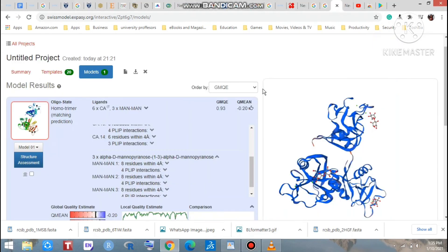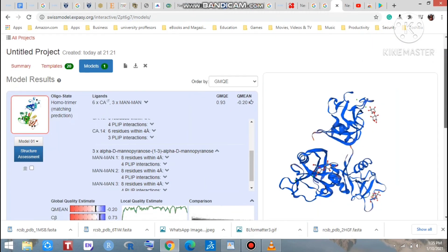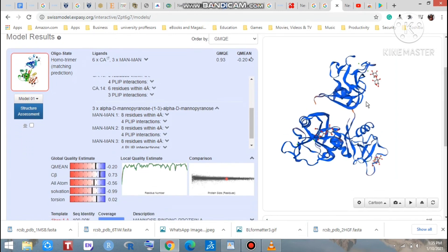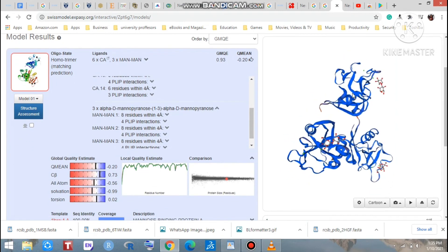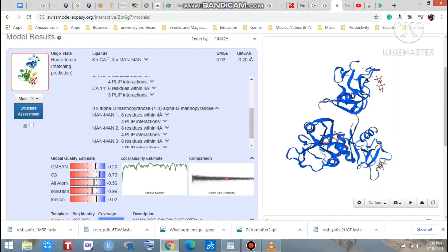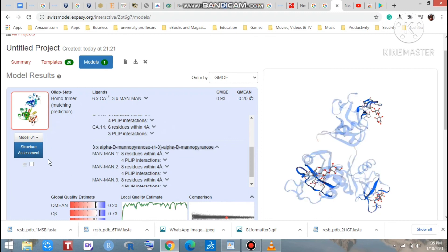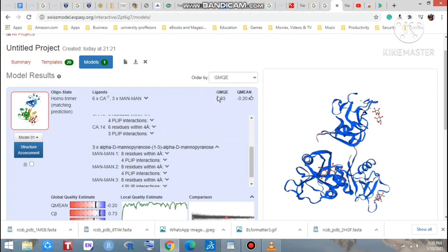Look at that, that is our result. Yes, that is the 3D structure which we are searching for. That is an oligo state and homo trimer. Okay, you can see two of the scores here: one is the GMQE which we have selected before in the template selection part, and the another is QMEAN score.